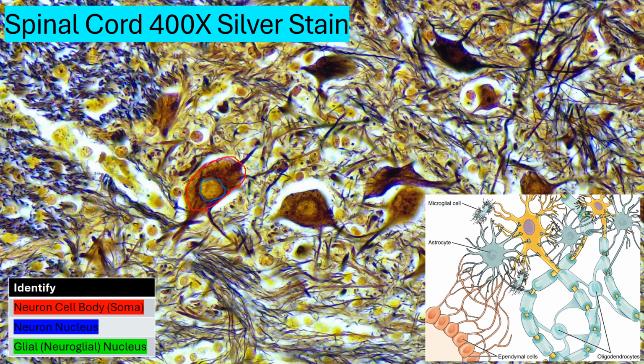Next, we're going to be looking at our glial cells. And our glial cells, it's going to be hard to see because of the color that they are highlighted in my diagram down below, or my table rather. But we have glial cell nuclei. Here's one there, another one, another one. You can look all over the place, and it's pretty obvious we have a lot of these circular structures. Those are our glial nuclei. Now, note that they clearly outnumber our neurons.